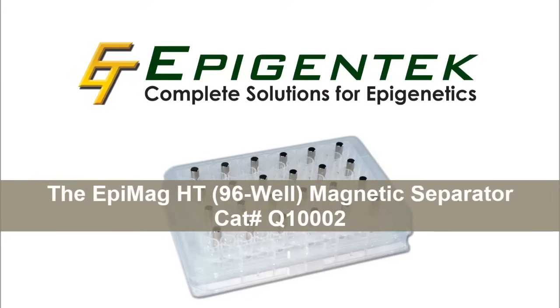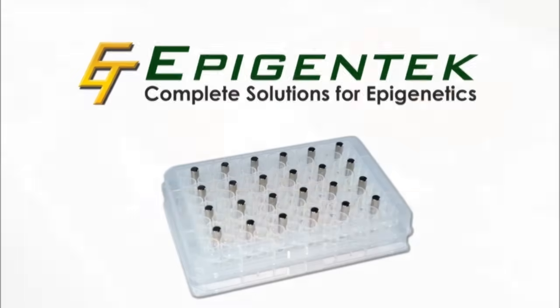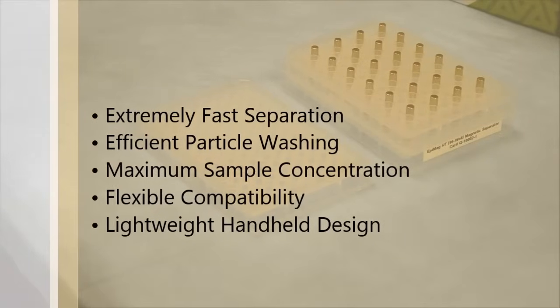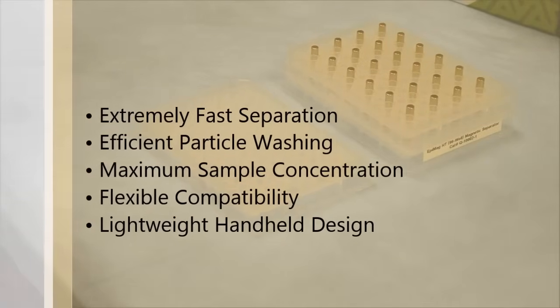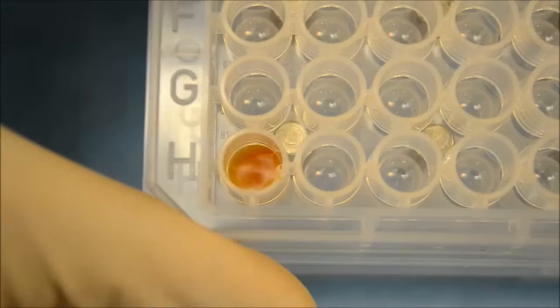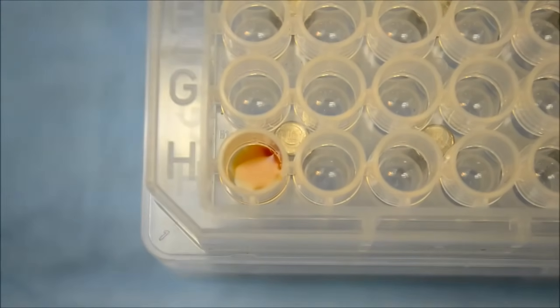The EpiMag Magnetic Separator is a powerful magnetic stand for paramagnetic bead precipitation of liquid samples from various 96-well microplates. Fast and efficient, this magnetic separation of standard purification beads takes only seconds with the EpiMag, as you can see in this real-time demonstration.